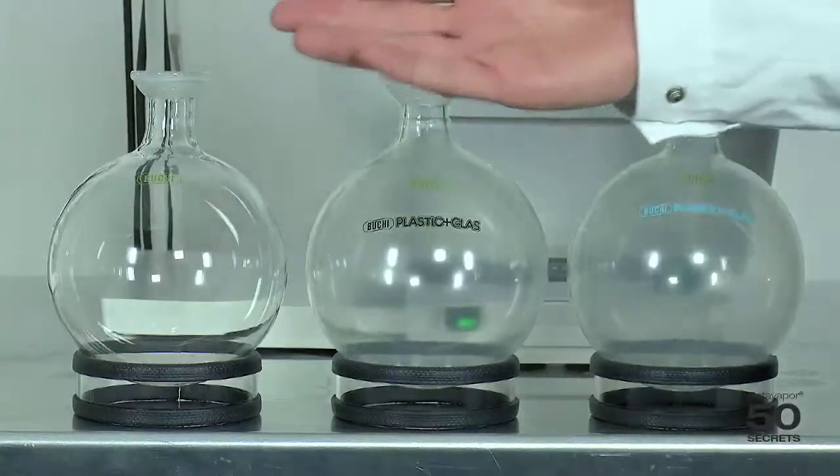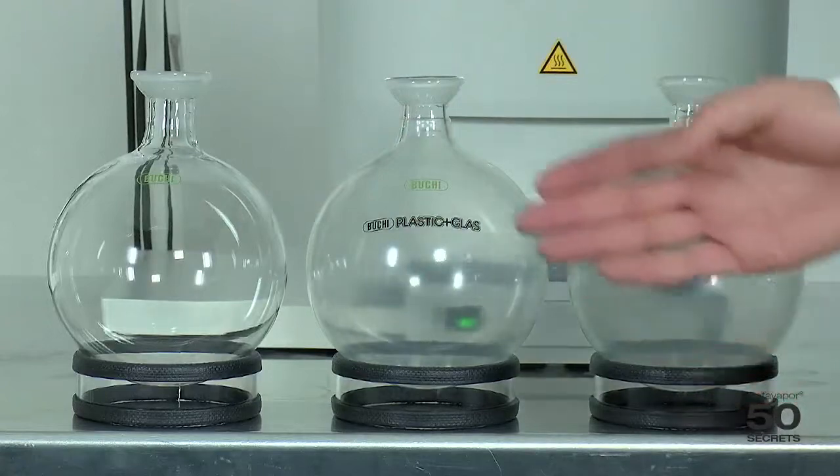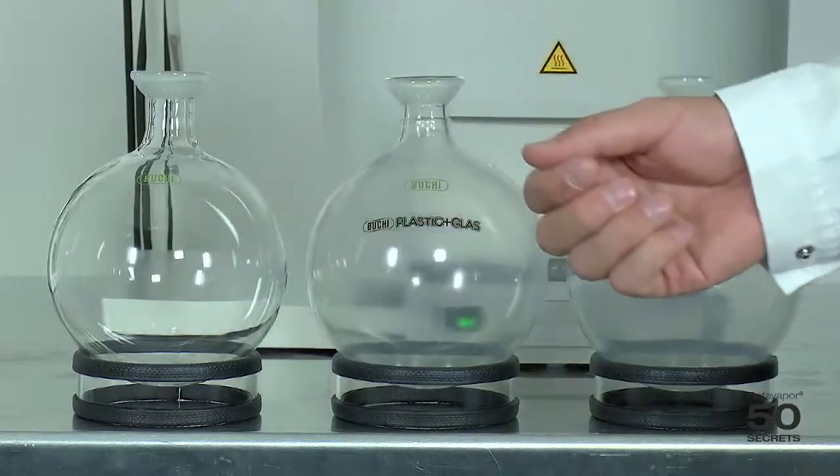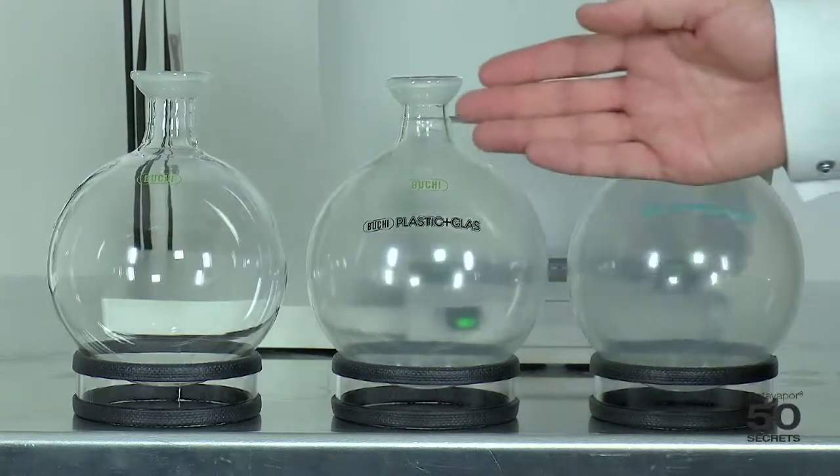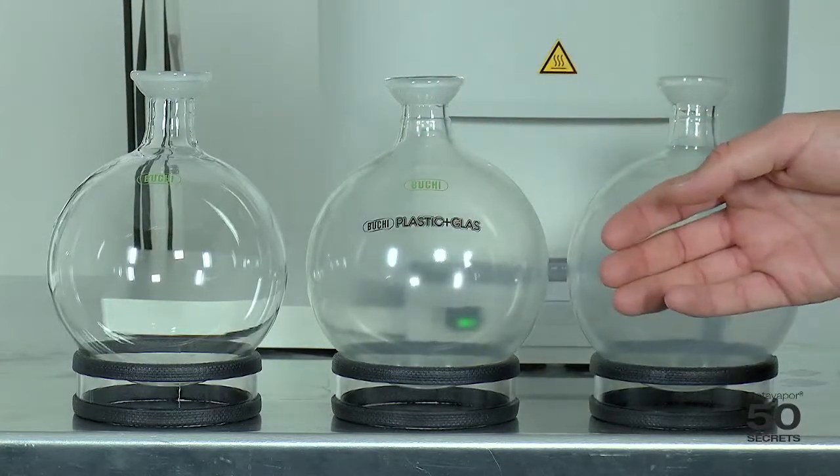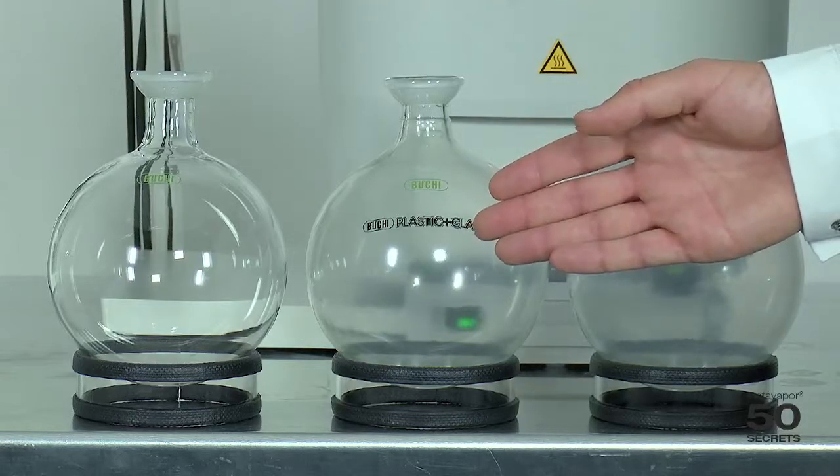Here we see three different receiving flasks. The very left one has no coating at all, just plain borosilicate glass. The one in the middle is plastic and glass coated, the standard coating we offer.